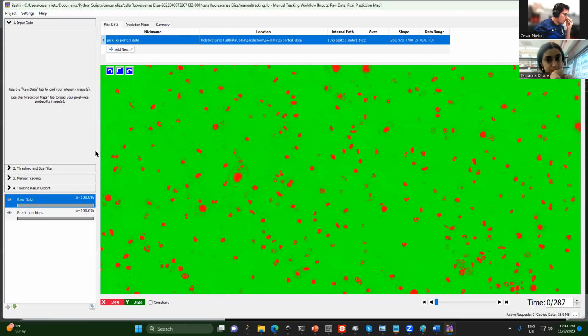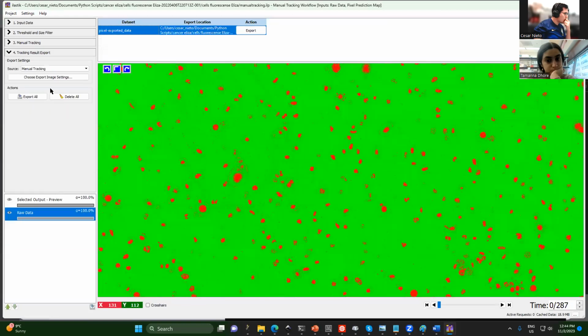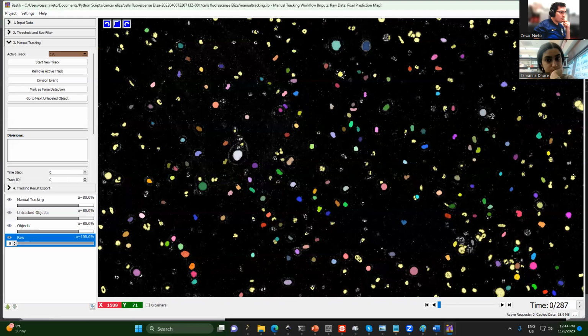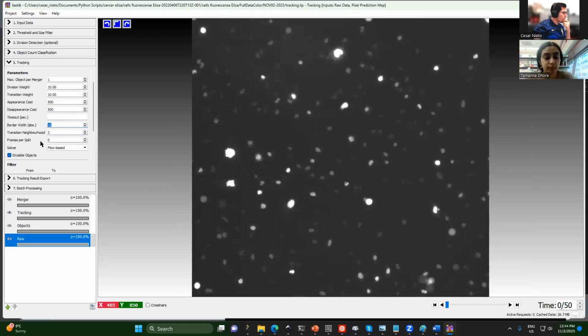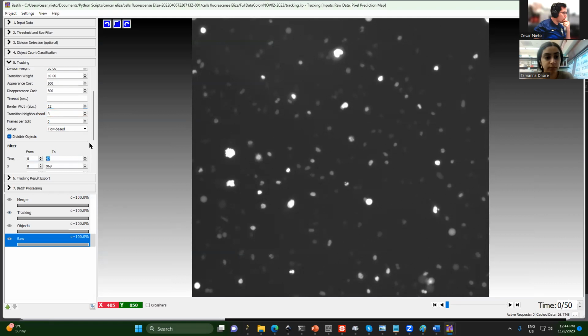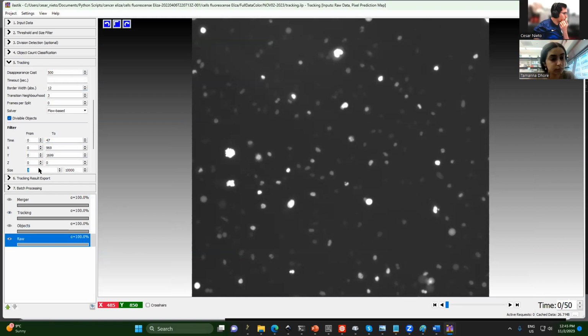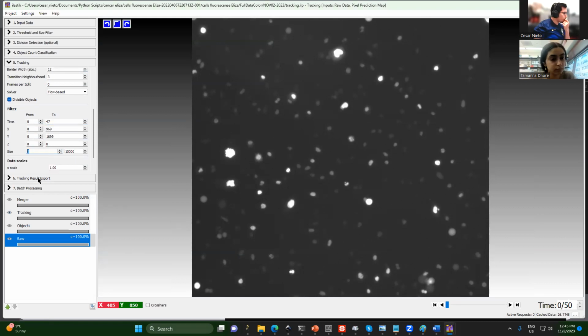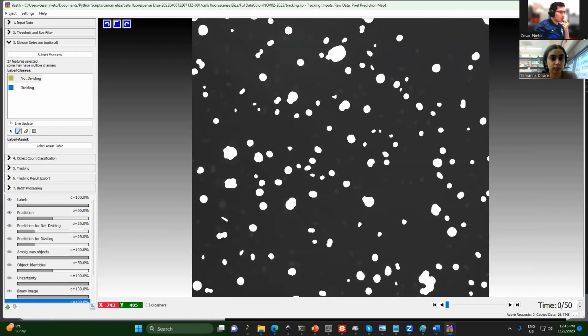This one was the manual tracking workflow. Yes, I tried to do it automatic and it's not very good. But you can try here, I think. Let's see.